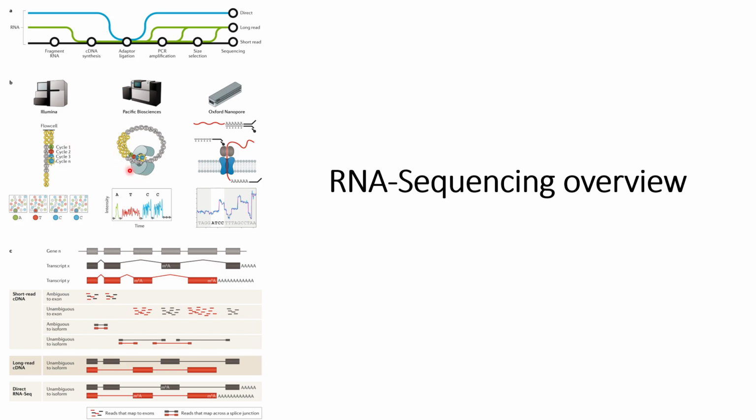Quite a similar mechanism is used by Pacific Biosciences.